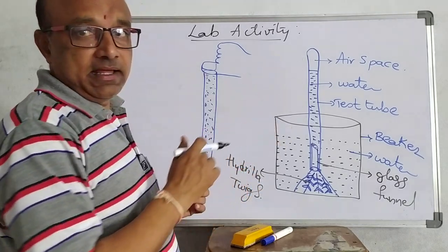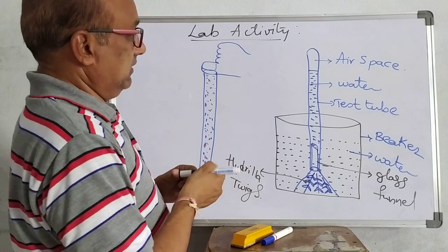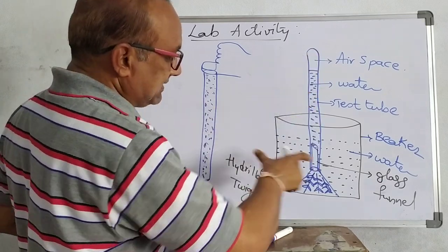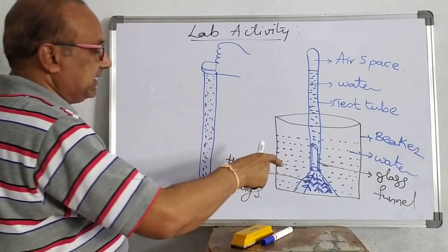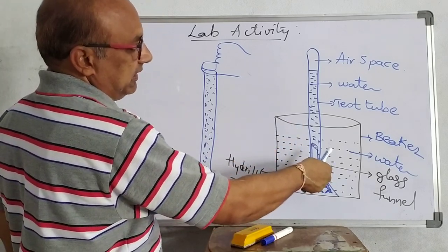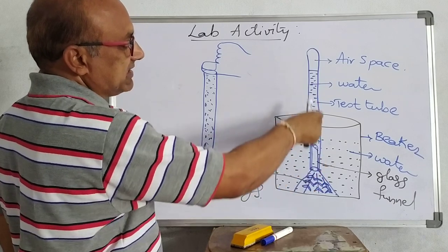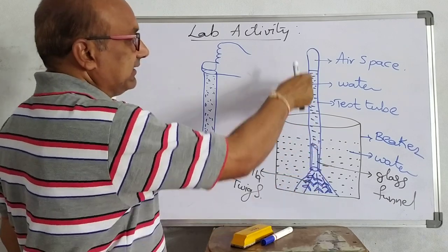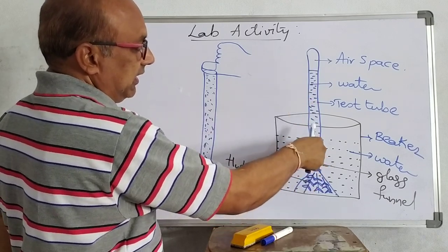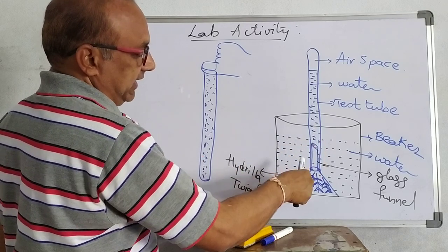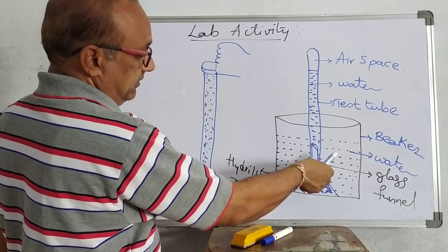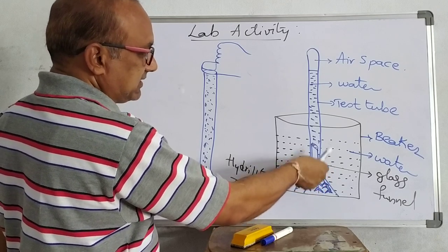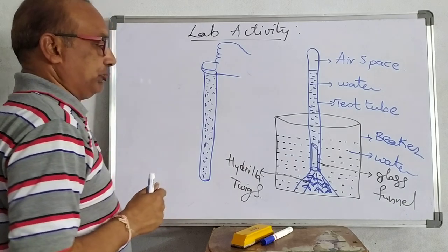In this manner the apparatus is arranged, and care should be taken such that there should not be gap while inserting. After inserting the test tube into the inverted funnel narrow end, if any gap is there that can be filled with some wax or grease-like things, such that the water will be held in the test tube.